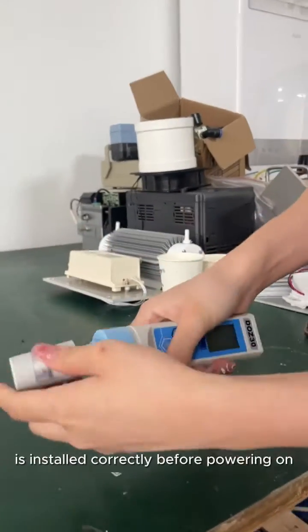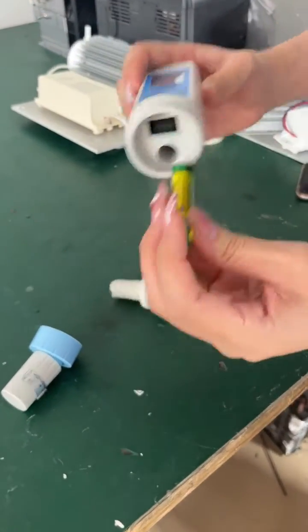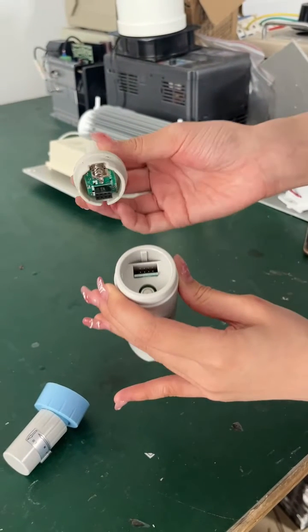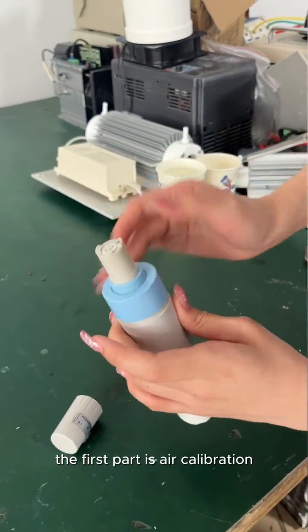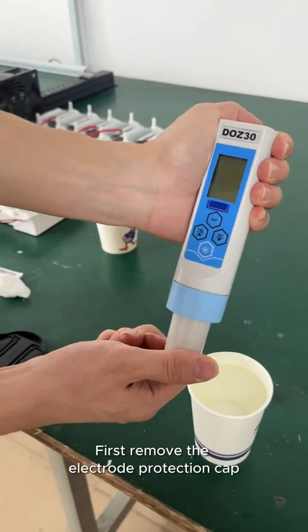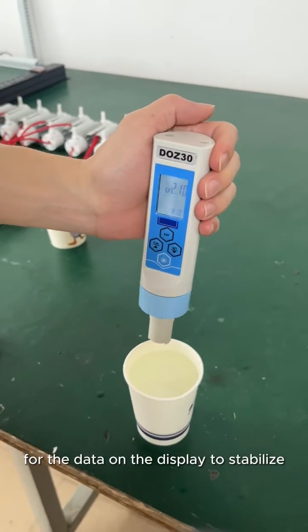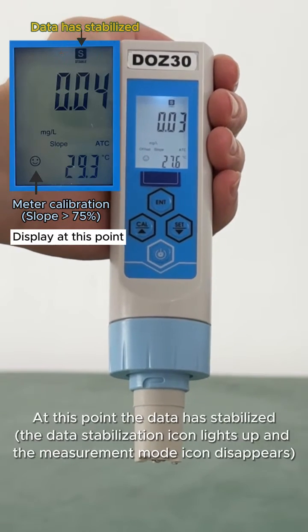First, check that the battery is installed correctly before powering on. To calibrate the tester there are two parts. The first part is air calibration. Remove the electrode protection cap, press the power on button, and wait for the data on the display to stabilize. At this time, the measurement mode icon is flashing.